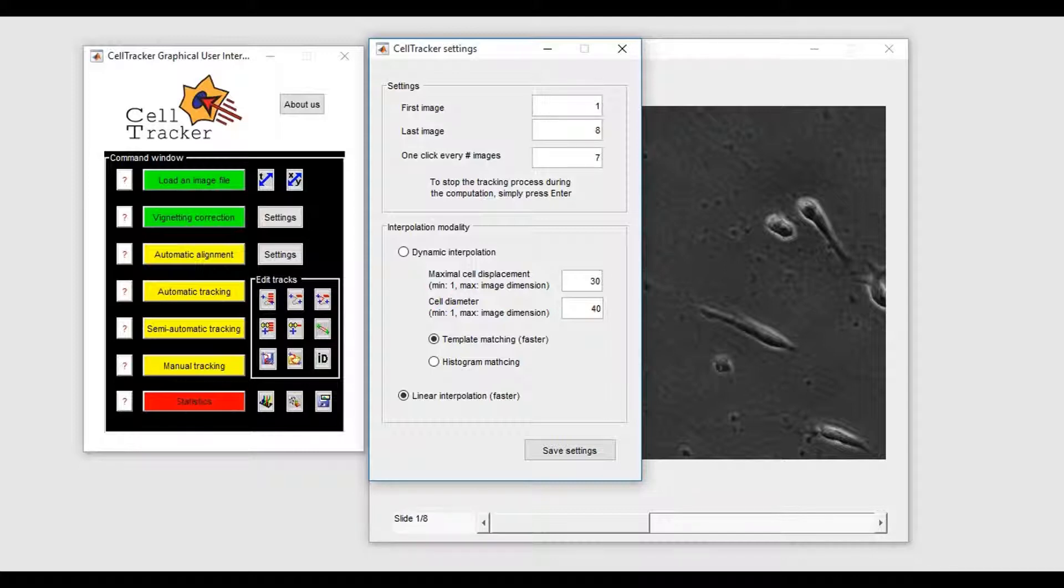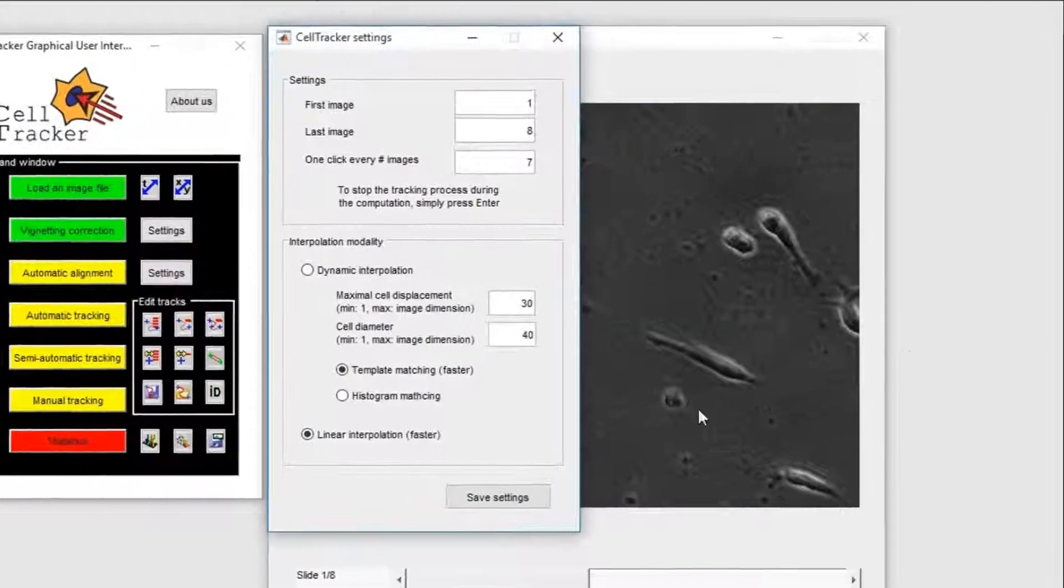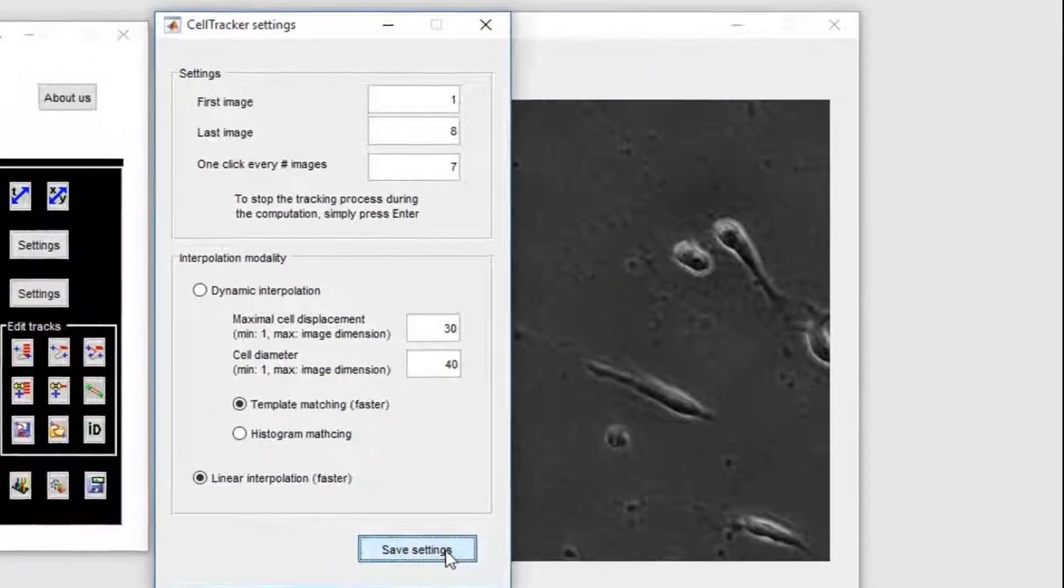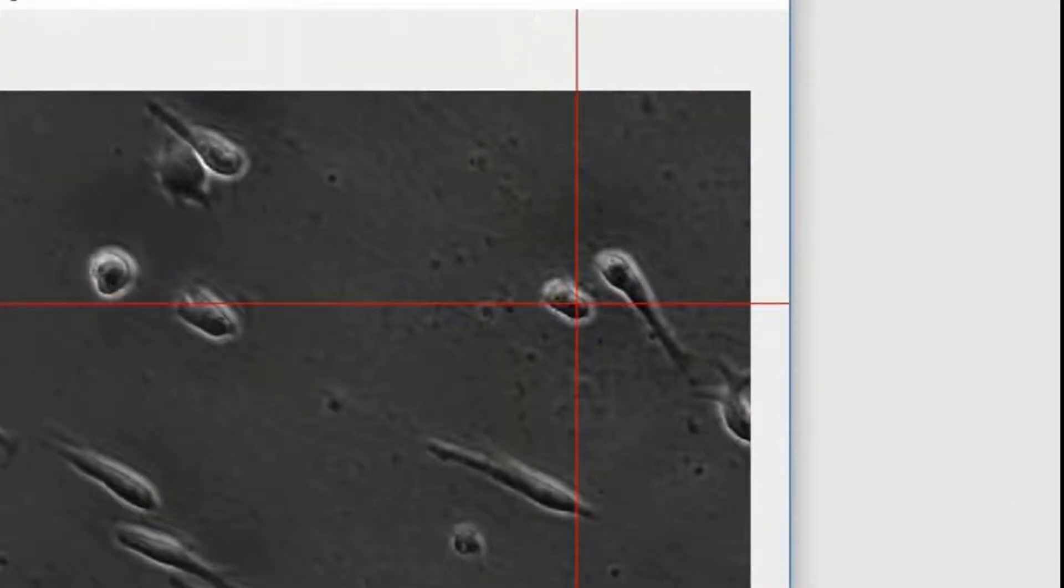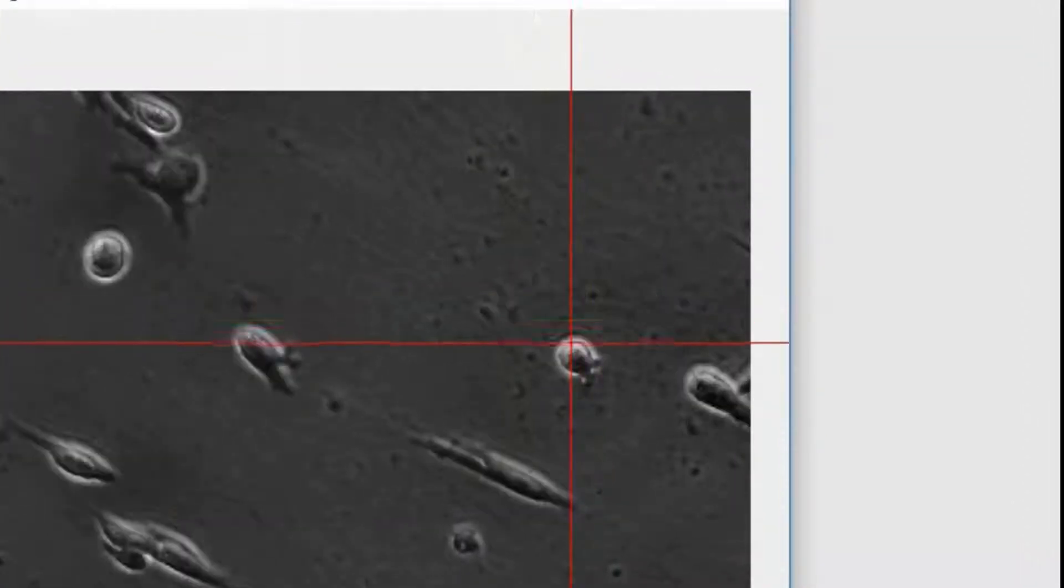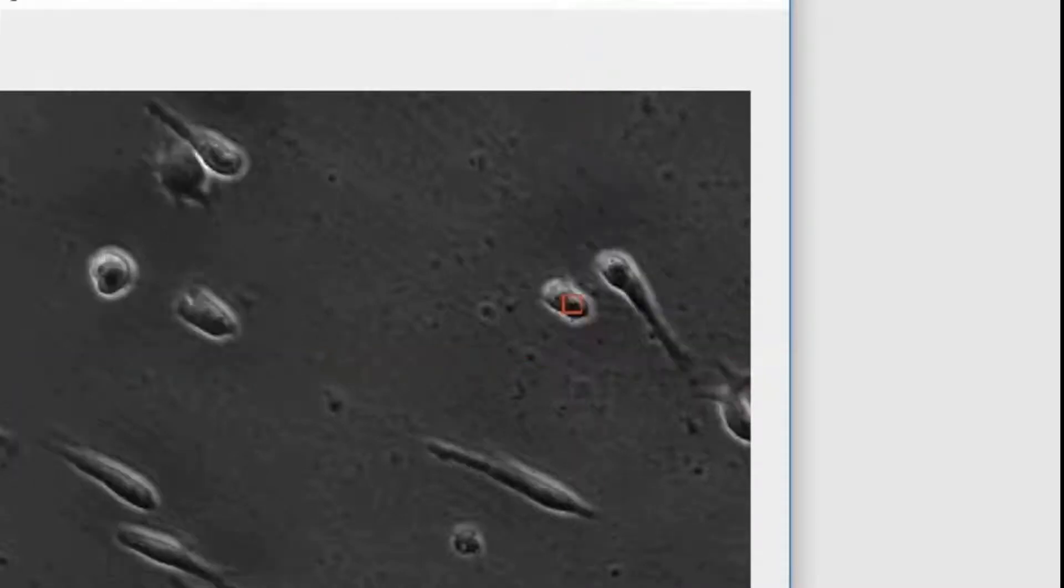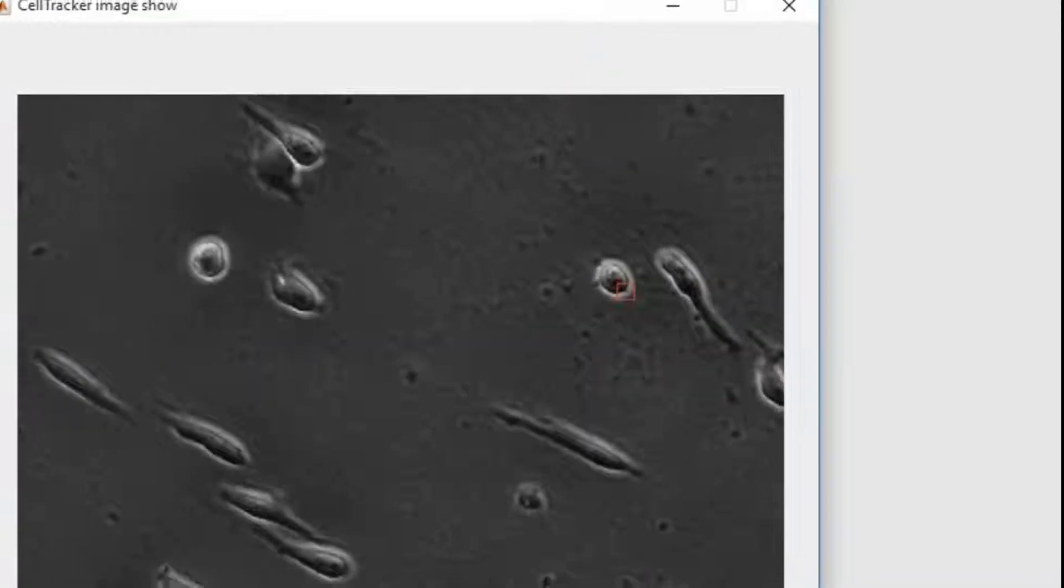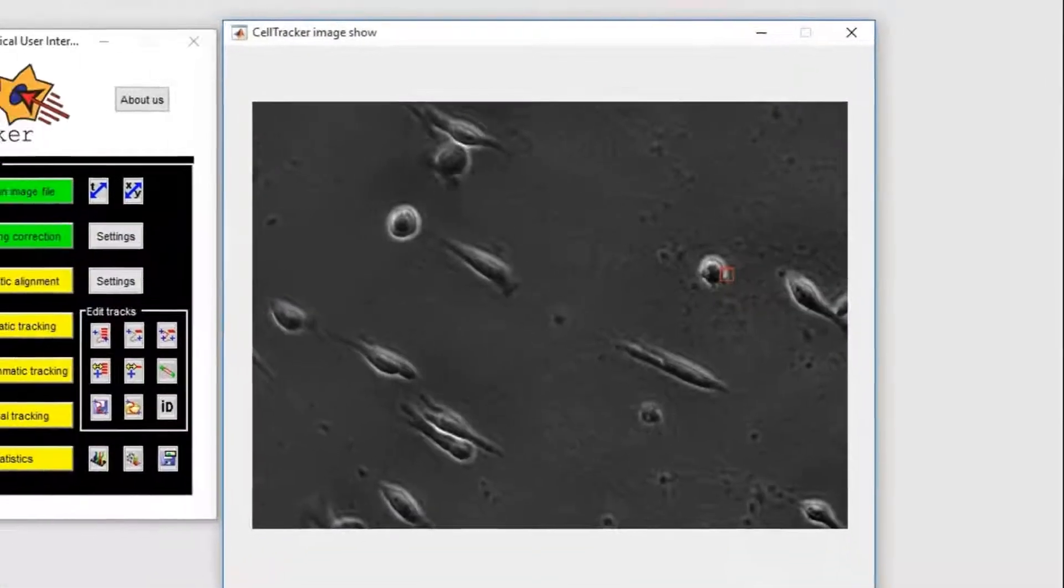I will show you the difference between these two interpolation modalities. This cell moves in a circular direction. Interpolating linearly the first and the last one manually selected, we obtain a false track.